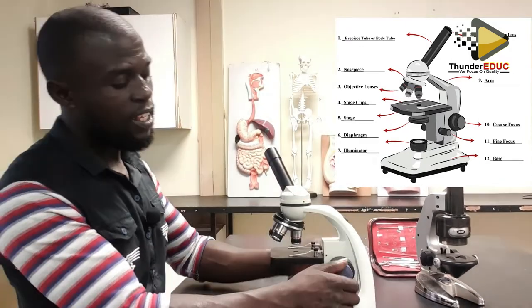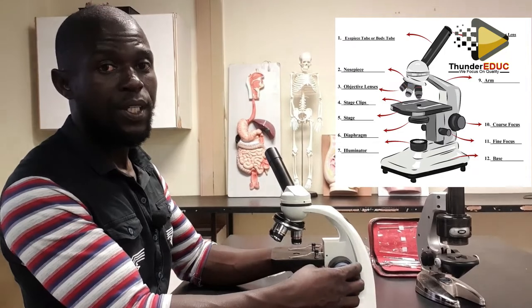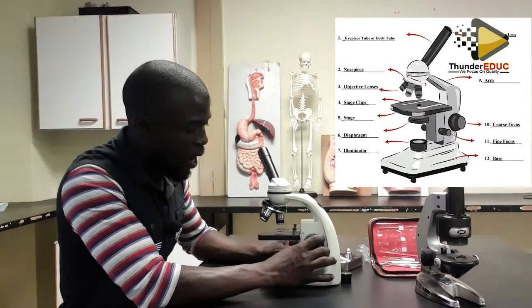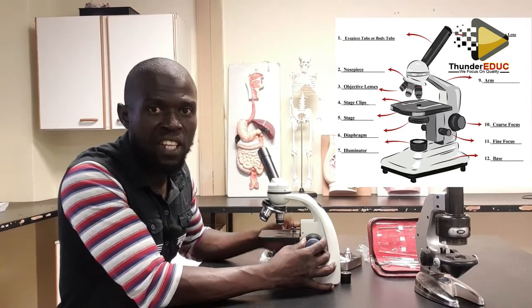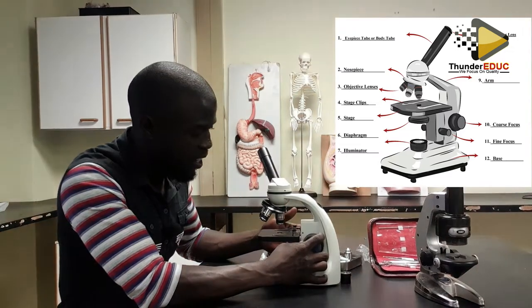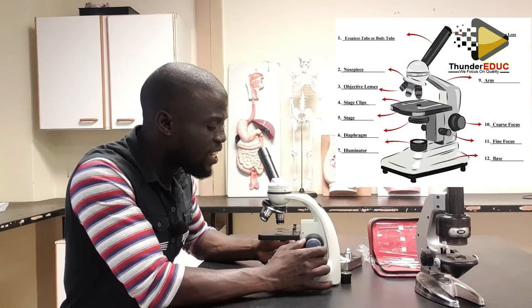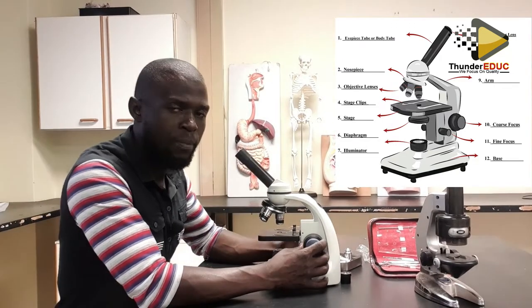Then it has these knobs. This knob, the big one, we call the coarse adjustment knob. You adjust, that's why it's called adjustment. And then you have what is called a fine adjustment knob. The function of the coarse adjustment knob is to bring the object into focus.